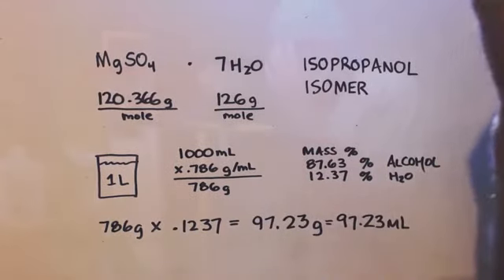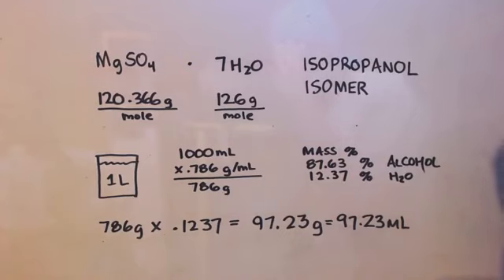Another thing you can do is salt it out before you do this process here, and that way you won't have to put as much magnesium sulfate in. You know what I mean? You'd take your liter, you would put in some table salt and keep putting it in there until it was saturated, meaning there's so much in there that some of it's laying at the bottom.